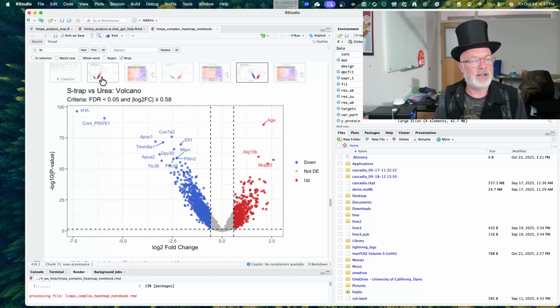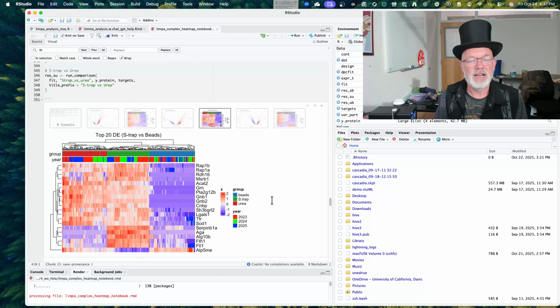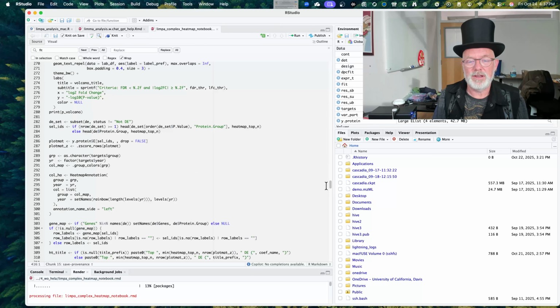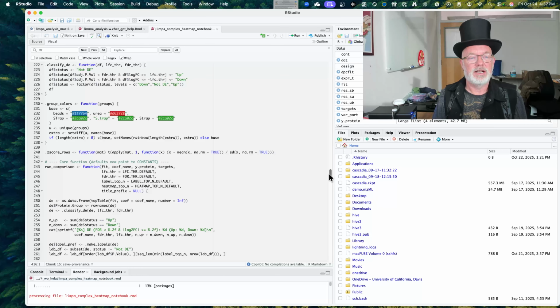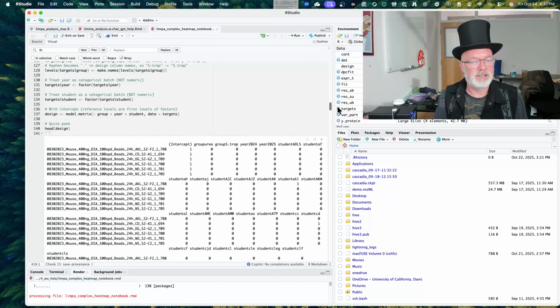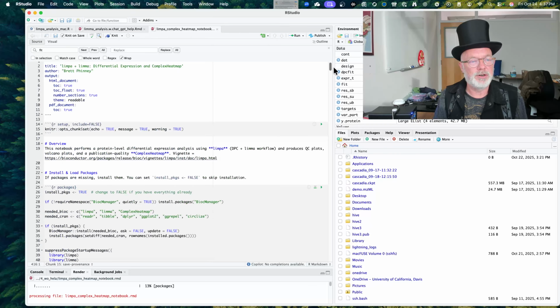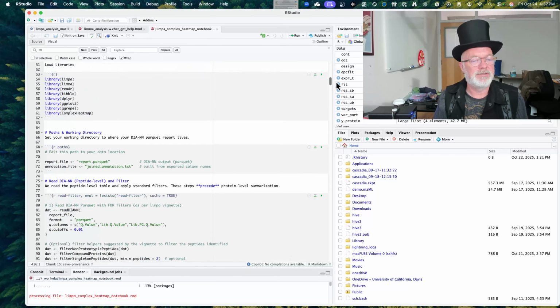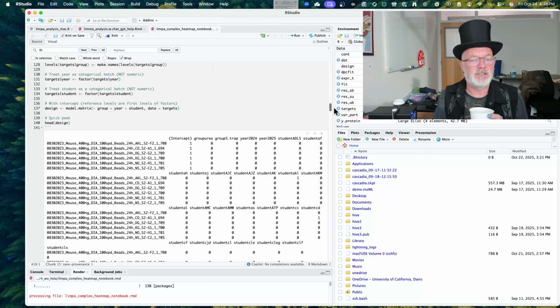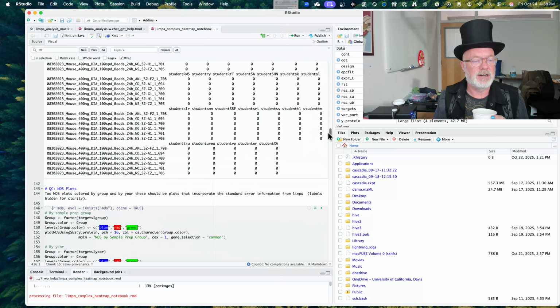And so I think if you just use this code and put your data in here, it should be really easy to modify. My rule of thumb, I also like MSDAP, but my rule of thumb is that Limma's been around forever. All the statisticians pretty much trust it, at least the statisticians here do. And Limpa is based on Limma, and even though it's pretty new, my favorite statistician here, Blythe, really likes it. So I think it's pretty good. If you want to do differential expression and you want to be pretty sure you're doing it correctly, I would try Limpa.